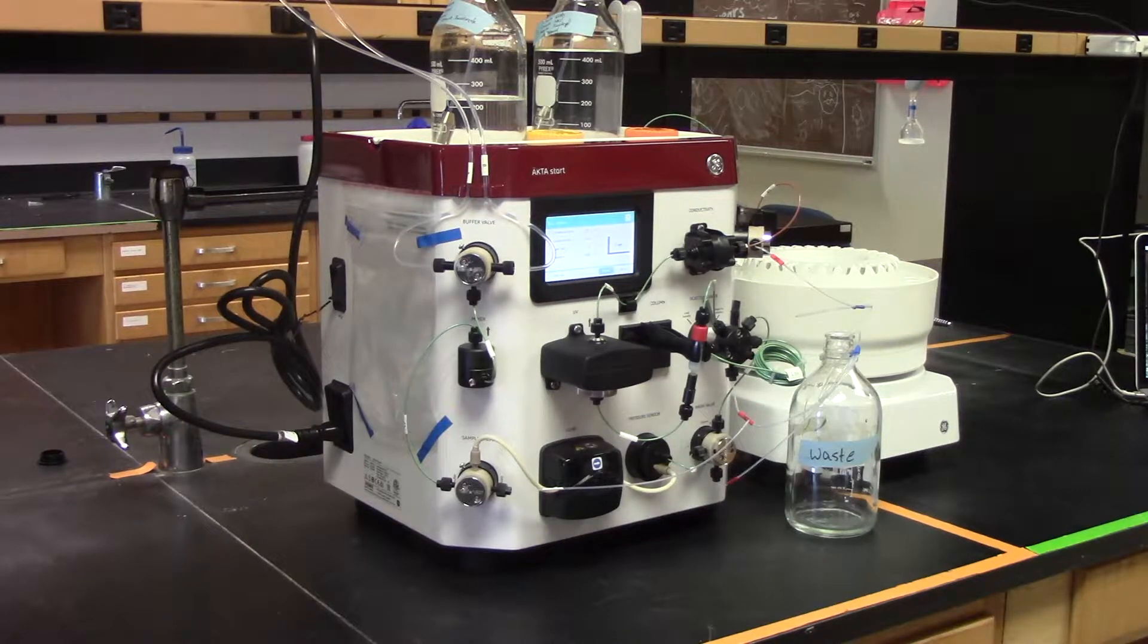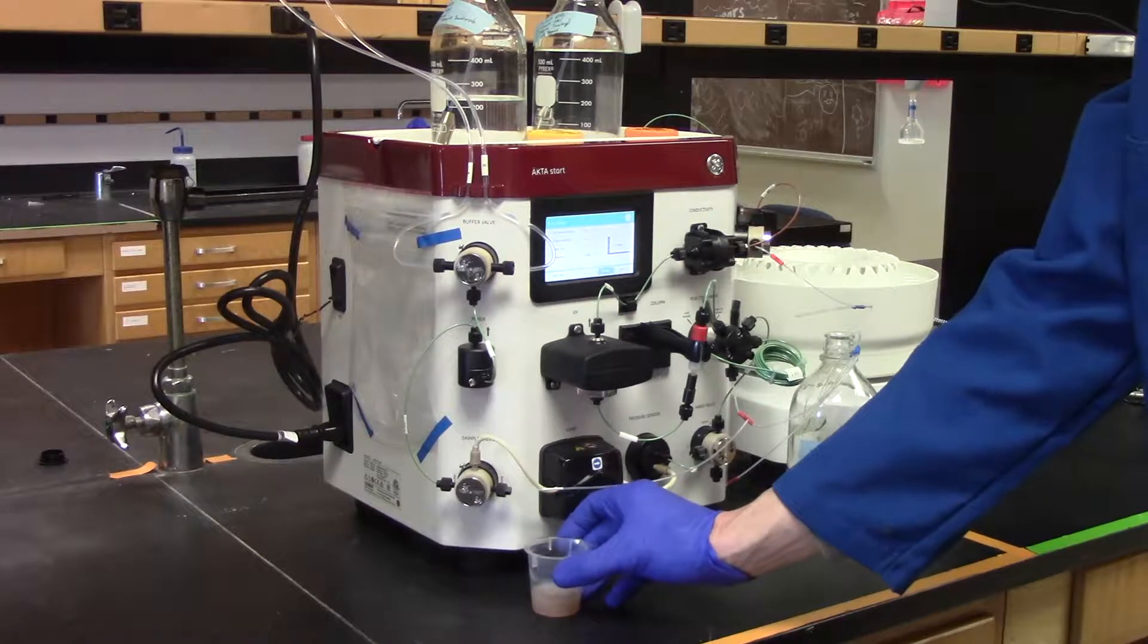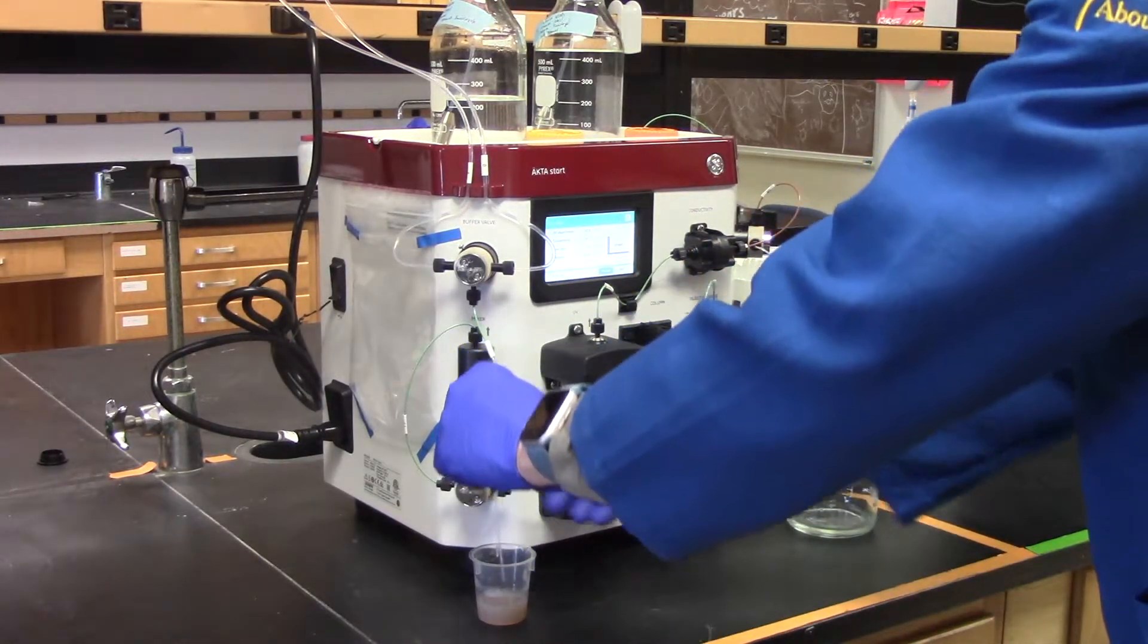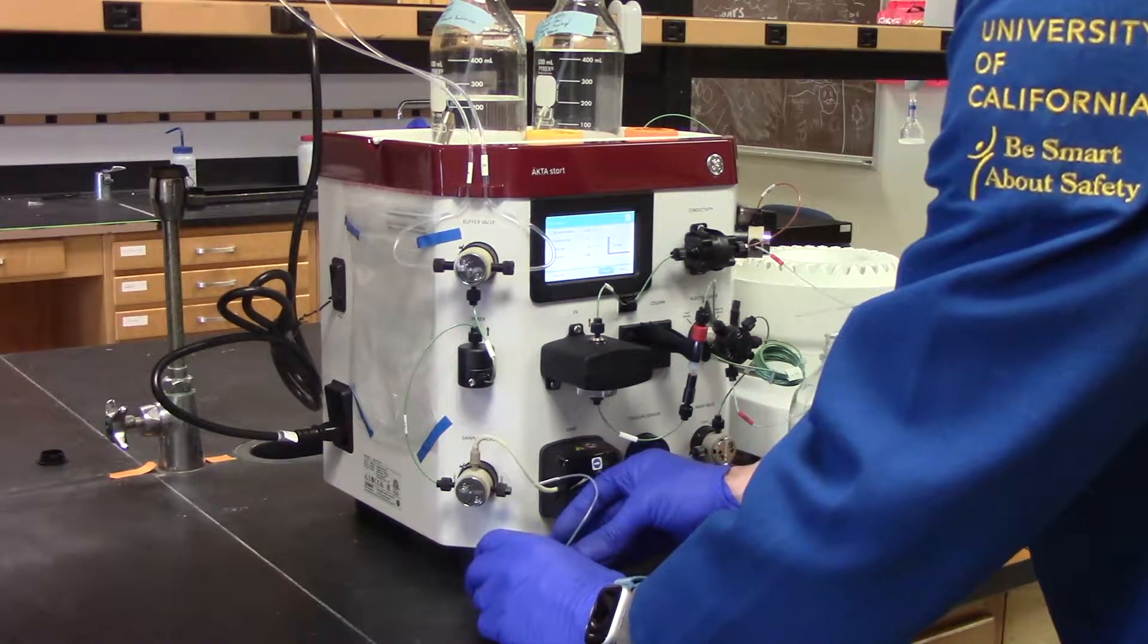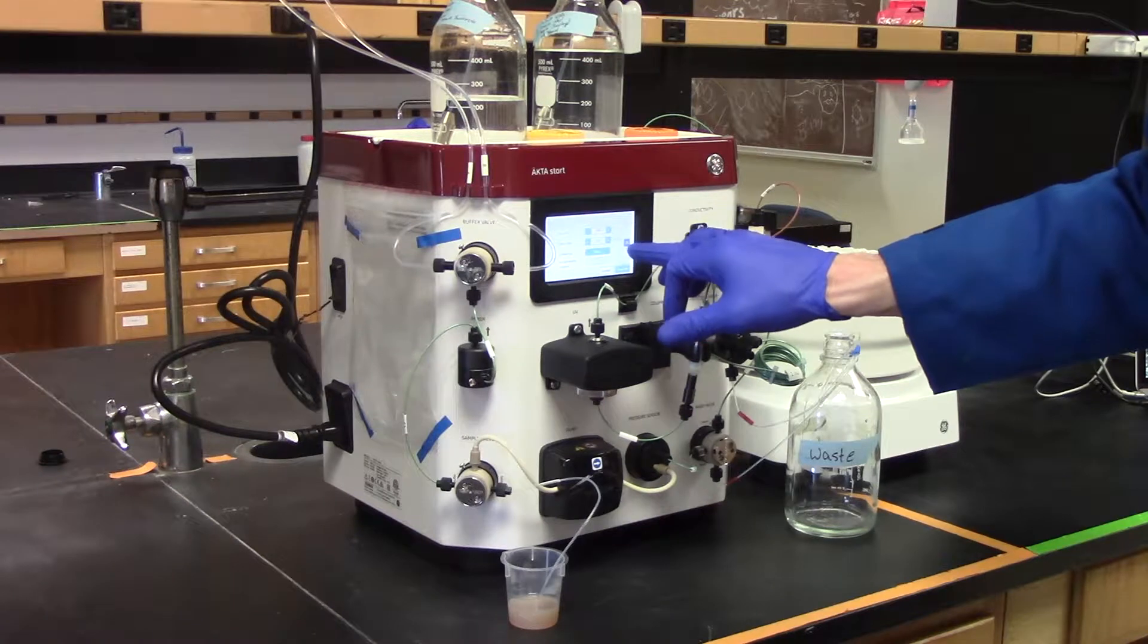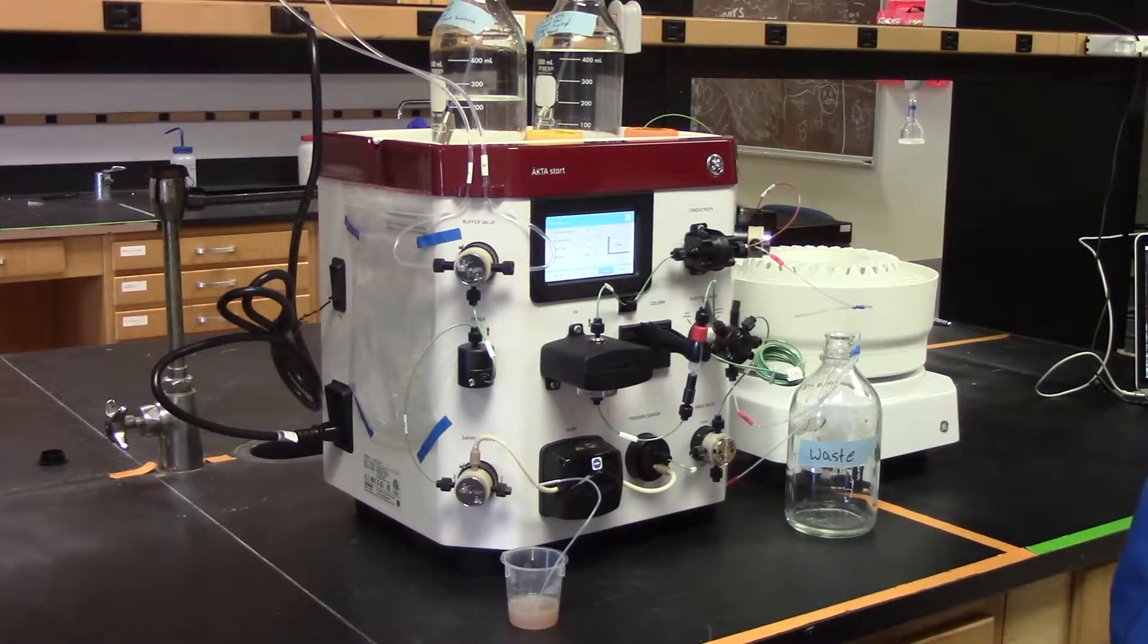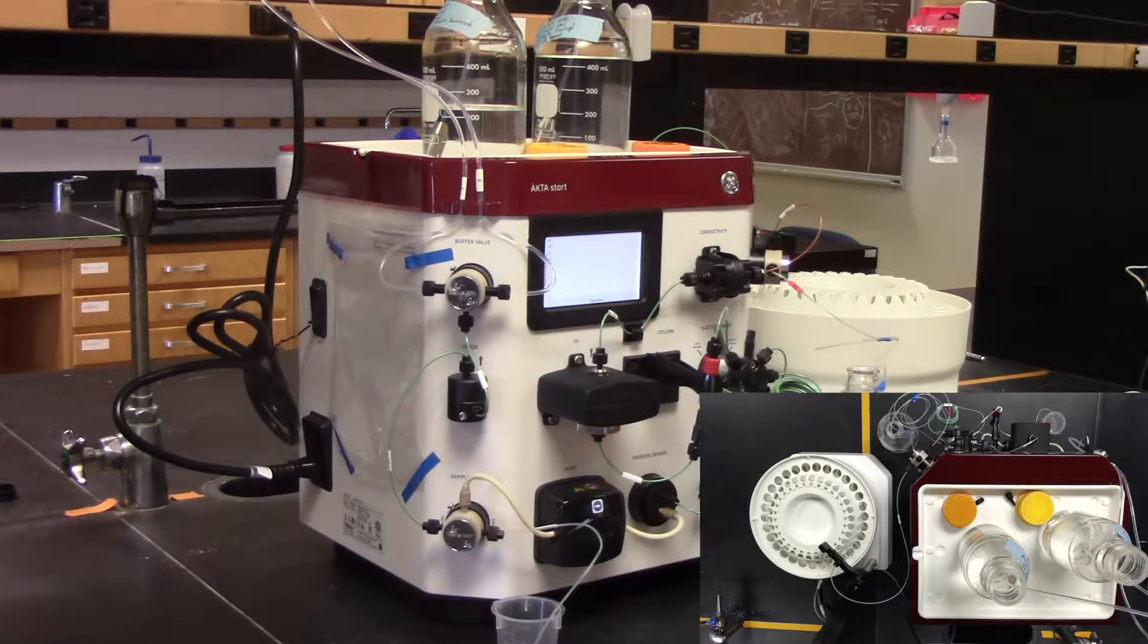Next, add your lysate to the FPLC by inserting the sample line into your lysate. Be sure not to spill your lysate. Purge your sample line by bypassing the column and flowing the FPLC for 1 or 2 minutes so that no bubbles are in the line. Switch the valve so that your lysate flows back over the column and load your lysate over the column.